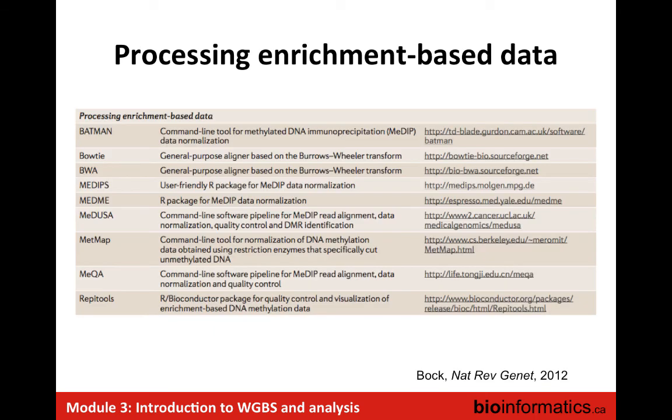We also won't focus on this, but this is just to give you some ideas of how to do the processing of this enrichment-based data. As opposed to the microarrays, which was really software to do microarray data analysis and normalization, this is in some cases similar to what you've done with the ChIP-seq, where you're going to be using mapping algorithms where you're getting reads, so you map them using Bowtie and BWA, for instance. But then you'll have tools that are specific to methylation data and looking for enrichment in these data sets.